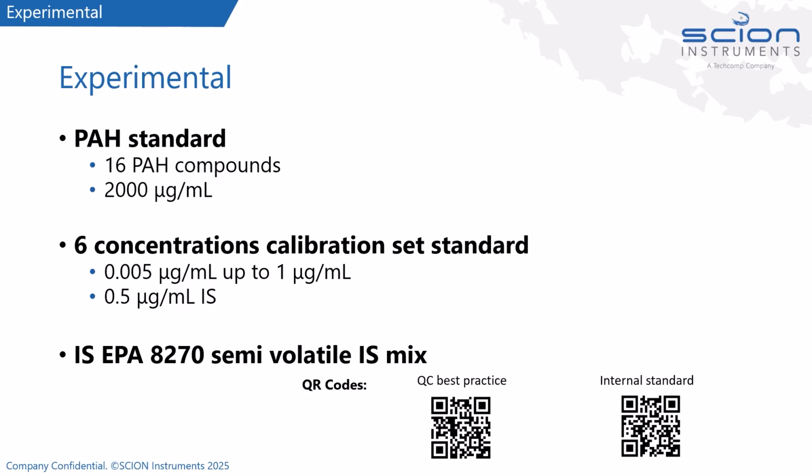The peak area of the standard is divided by the peak area of the internal standard, giving a ratio. This ratio is used to calculate the results, making sure that any bad sample preparation or bad injection into the GC is resolved.